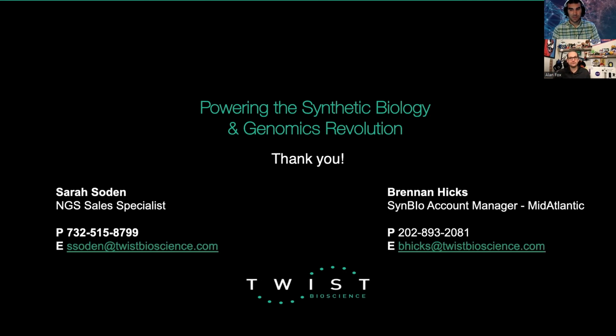So I had a quick question. This is with the HLA kit that you mentioned. Is this for the long reads? Yeah, both, actually. Both, okay. Yep, both a short read and a long read option for that.